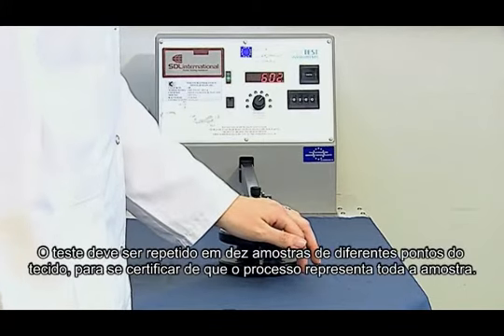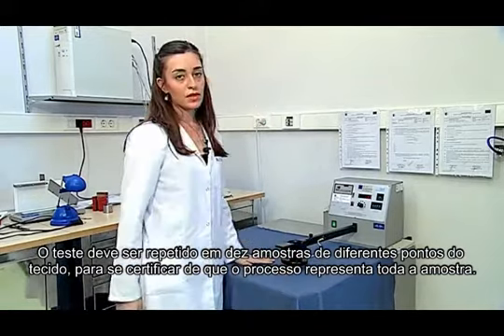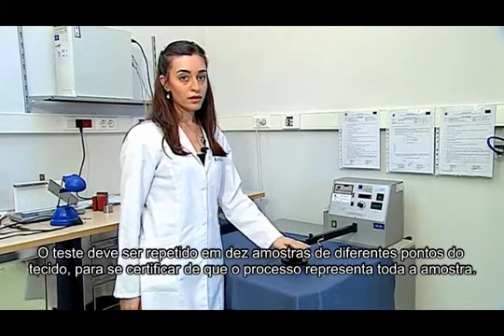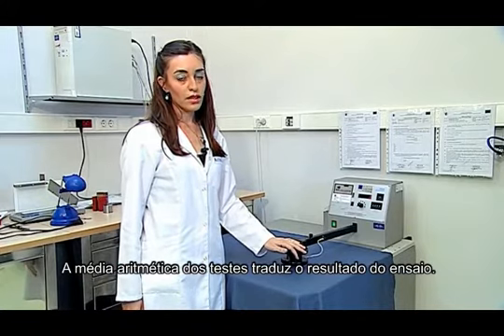The test must be repeated on 10 samples from different sections of the fabric in order to make sure that this process represents the whole sample. The arithmetic mean of the tests is given as the result of the experiment.